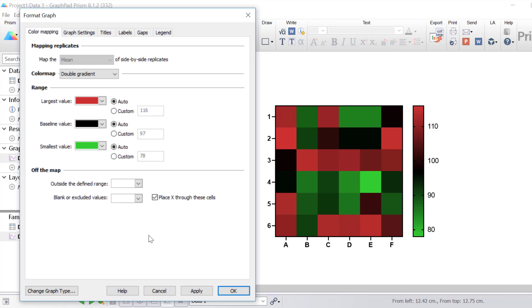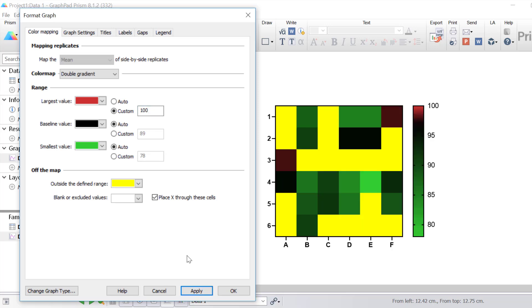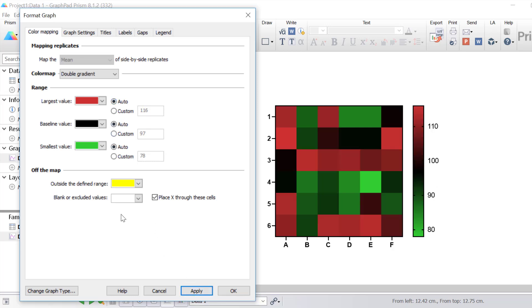Another important aspect you can change is what's known as off the map. Here you can choose a colour to use if the value is too large or too small to be part of the map you defined, or if the value is blank or excluded. These choices are irrelevant if no values are off the scale, blank or excluded. For example, if I change the largest value to a gene expression value of 100 and select yellow, notice now that any cells with a gene expression value above 100 are coloured yellow. I'm going to change my largest value back to auto and click apply.